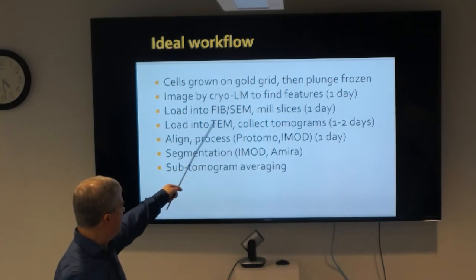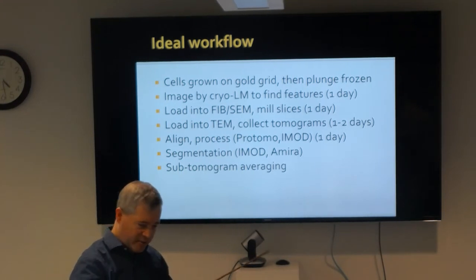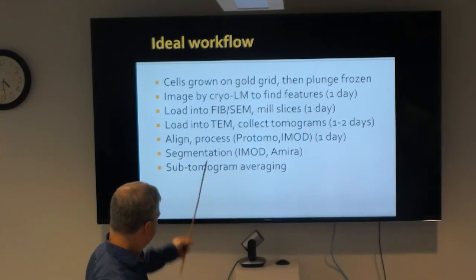Loading into the FIB-SEM, that works pretty well, and the milling, assuming all of the equipment is working well, that works pretty well. Rescuing it we can do, but it is a lot of work.